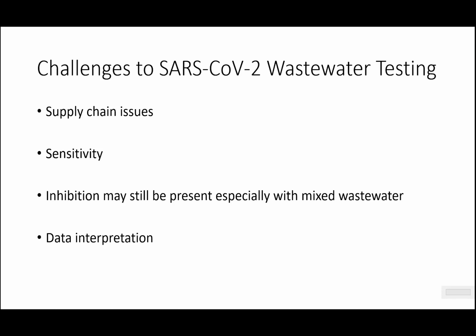Finally, the last issue I'll talk about is interpretation of the data. Wastewater surveillance is still a relatively new approach in the United States. And as I mentioned on the last slide, we can test the wastewater, come up with values of SARS-CoV-2 in the wastewater, and determine how those trends are occurring on a longitudinal basis. But really, further interpretation should be done in collaboration with federal, state, and local public health departments. They have more expertise in the area, and that's the way we've gone about this in talks with our local public health department.